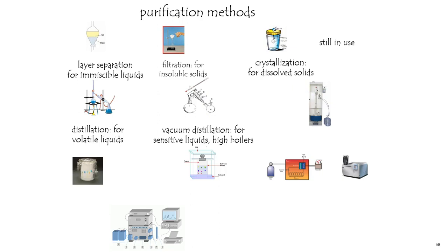It's not a vacuum distillation apparatus. This is known as a spinning band distillation apparatus. The idea here is to get awesome separation by using a huge distillation column. Not a couple inches here, but rather a couple of feet. And also stick what looks to be like window screen in there and spin it inside there to give you massive effective surface area, rendering your separations very efficient.